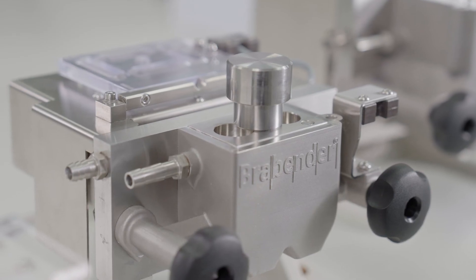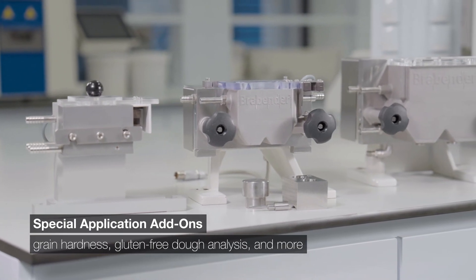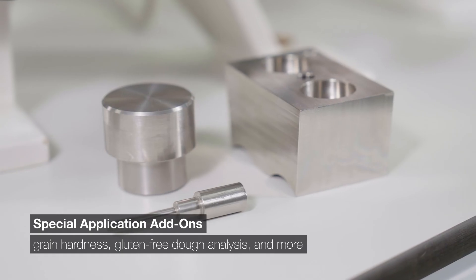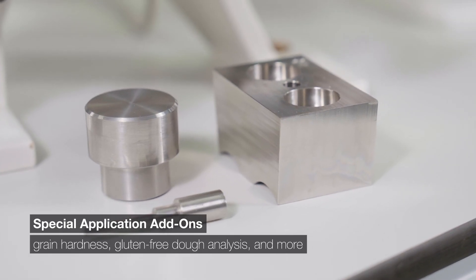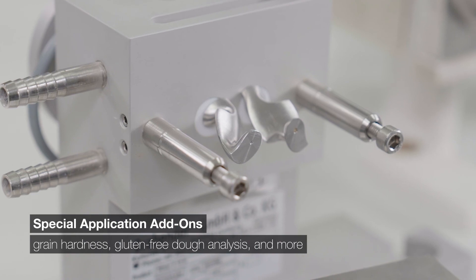Tailor your solution with premium, high-quality knitters from 10 and 50 grams to 300 grams. Experience unparalleled possibilities with special add-ons for grain hardness evaluation, gluten-free dough analysis, innovative foam studies, and more.